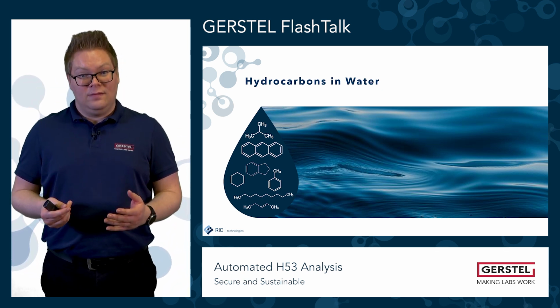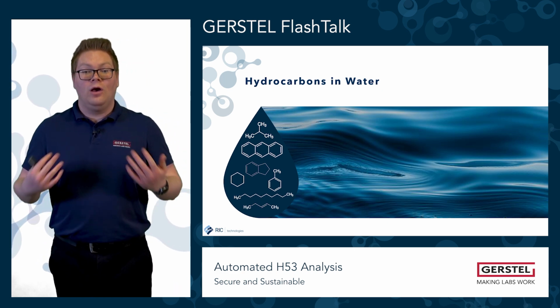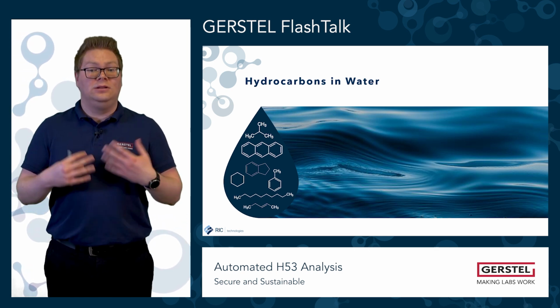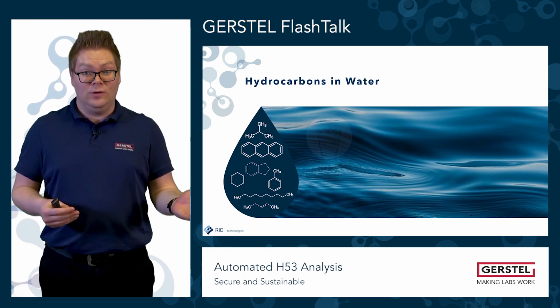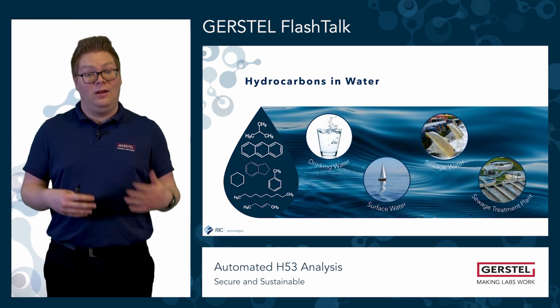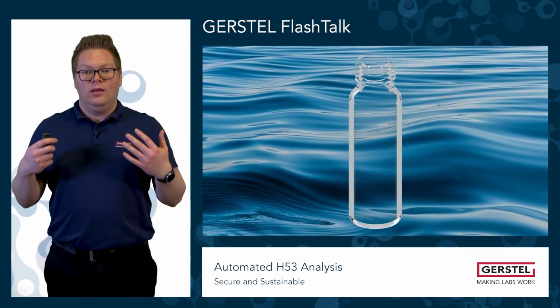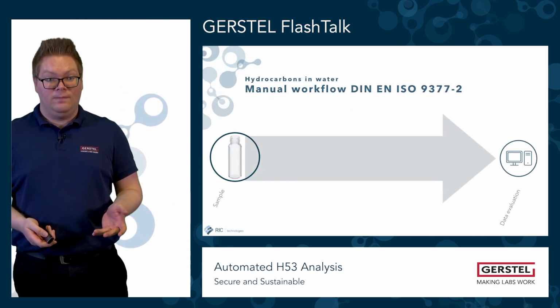The analysis is then done by a gas chromatography system coupled with an FID. The hydrocarbon index is determined in different matrices, like surface water or drinking water, or sewage water or sewage treatment plant drains. Once we have our water sample in our vial, the manual sample preparation workflow looks like this.